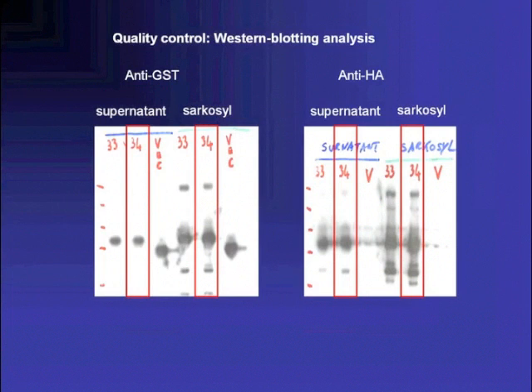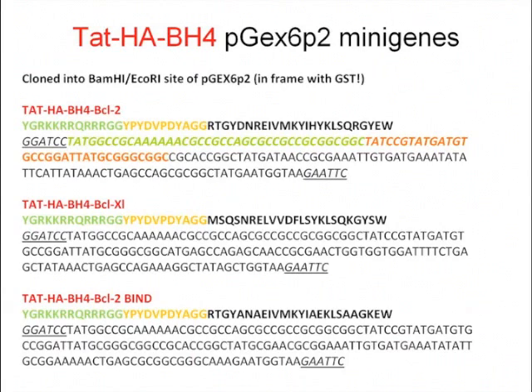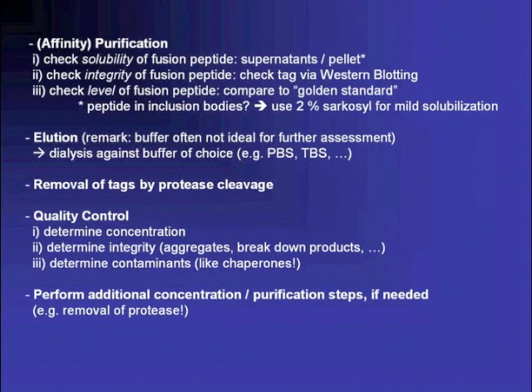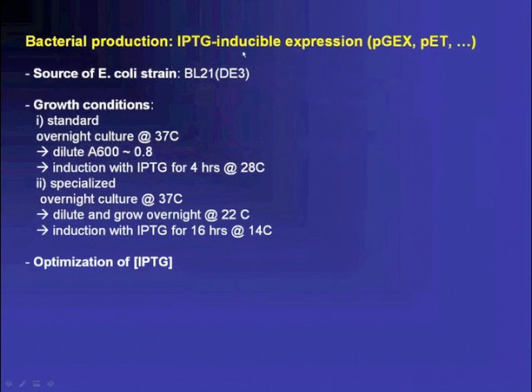Well, of course, I have to mention that here we selected a specific strain. When you're working with bacteria, what we are doing here is using the bacteria as a cellular bag, if I might say it in a disrespectful, crude way. Which means that this does not really reflect the cellular biology of E. coli. There might be, of course, when you are studying discrete species, distinct sequences produced by E. coli, but here we use the modified E. coli strain, which is really suitable for these expression systems.